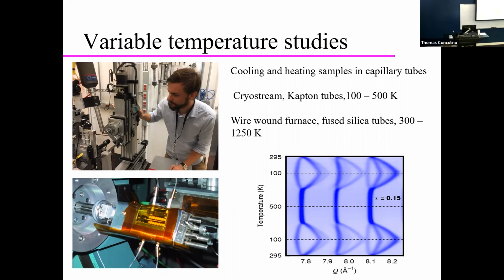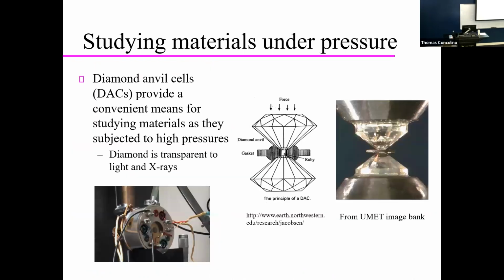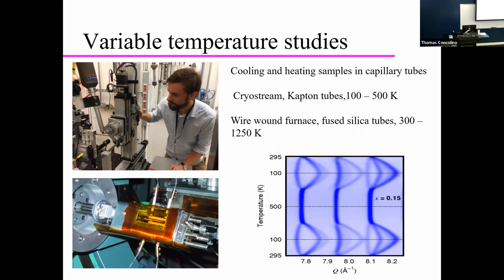These are powder diffraction data. Each one of these streaks is a Bragg peak. You can see this group of Bragg peaks splitting apart as we cool, as we reheat, they merge. You see some change in position due to thermal expansion. You get a picture here based on about 500 powder diffraction patterns collected, a few seconds exposure each. Very rich picture of what your sample is doing.